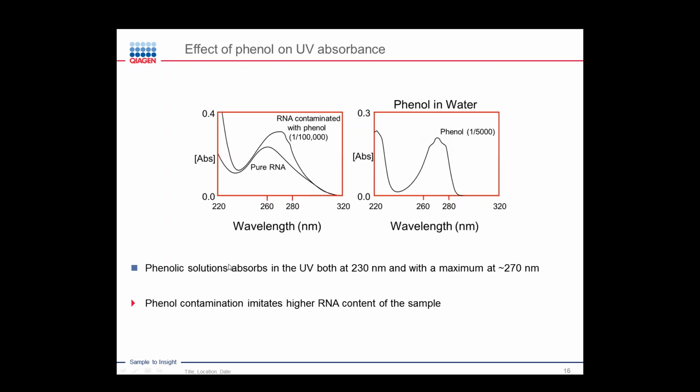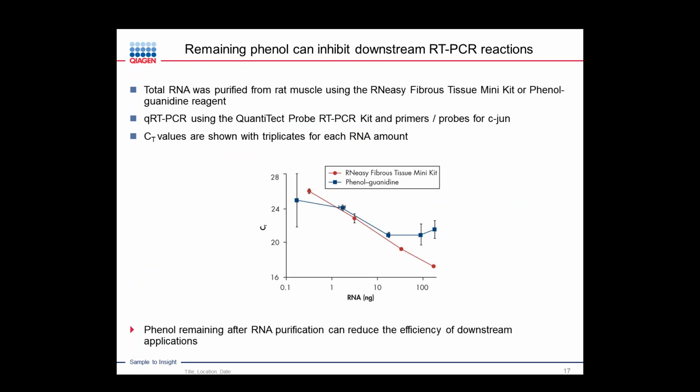But what is the influence of remaining phenol in your RNA sample in a downstream application like PCR? This is shown in the next slide. In this experiment, I will show you that the purity of nucleic acid has a critical effect on sensitive downstream applications.